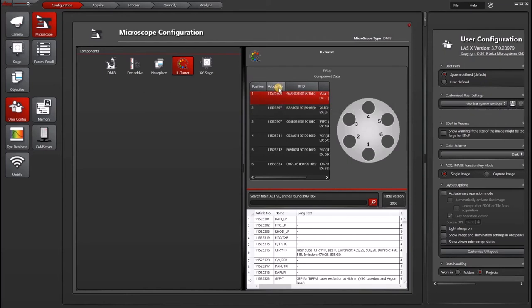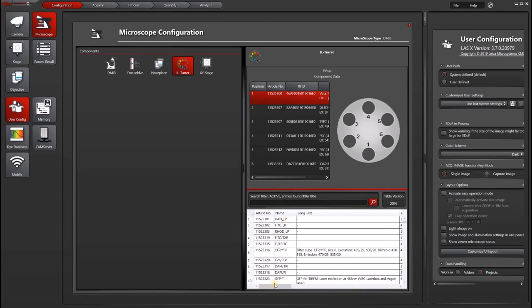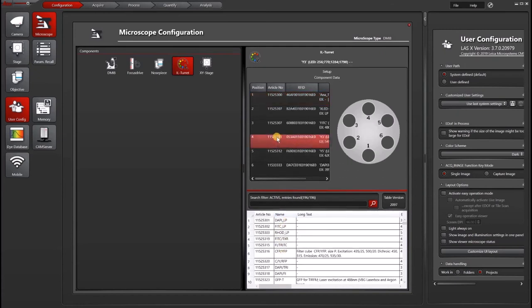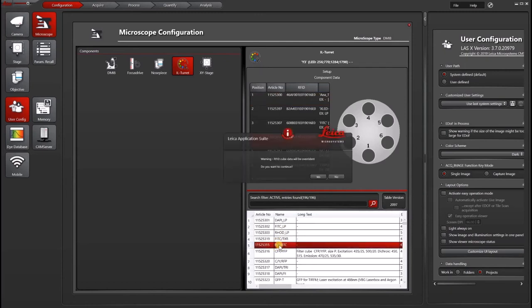But let's say you don't have an RFID microscope, in which case you would do the same thing as you did for the nose piece. You would search for your filter number or look for the name, go to the location that you stuck the filter in, and then double click to change it. I'm not going to continue because that's not the right filter cube.